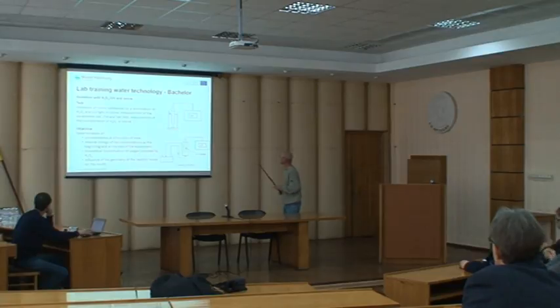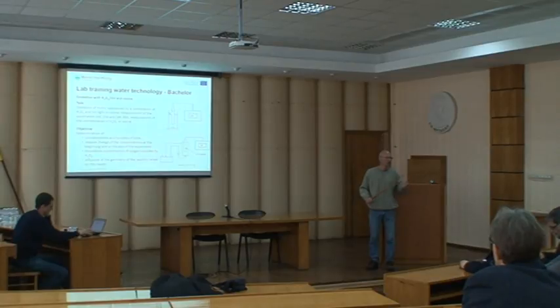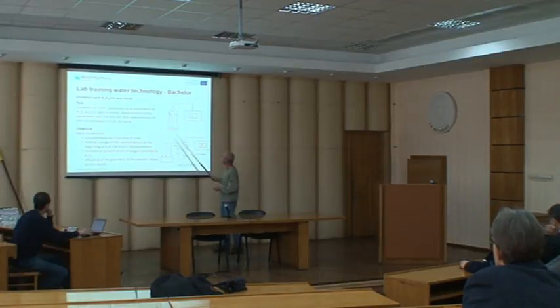These are only a few words. Oxidation of toxic substances or complex organic substances by ultraviolet light and H2O2 is an old method, like Fenton, probably with iron 2 salts. Here we use only UV and H2O2 in different kinds of reactors.